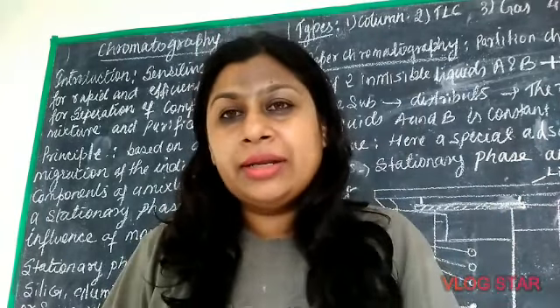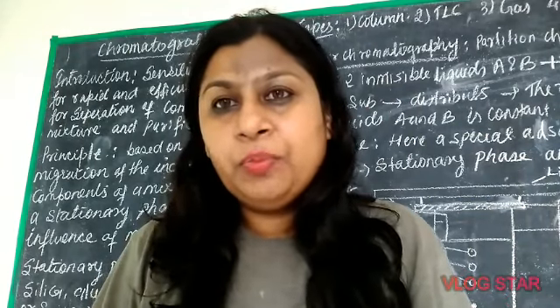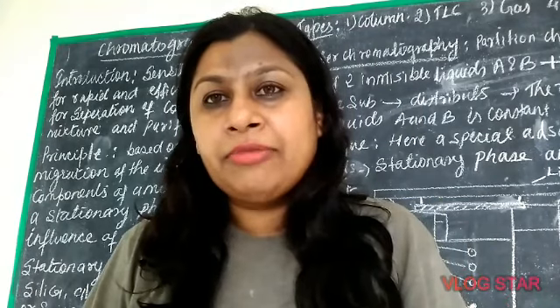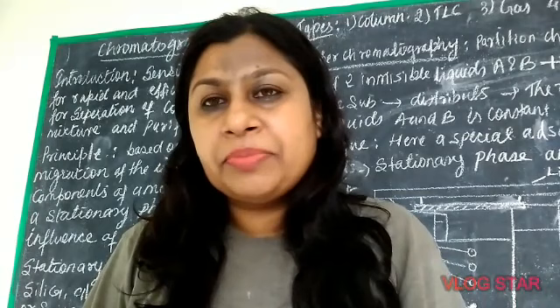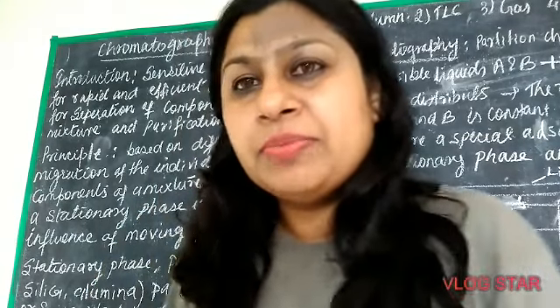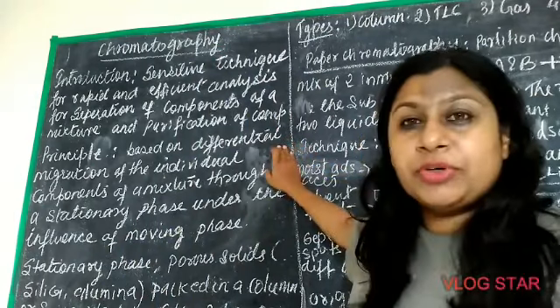Now we'll start with our next practical, that is chromatography. I hope you're aware of it. We are going to implement it, we're going to use it for separation. Now we'll see the principle. We'll see the introduction of chromatography.